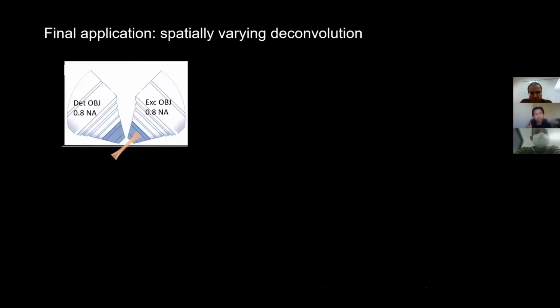So, it's always bothered me that in all of these microscopes we use, they're hopelessly inefficient, right? I mean, in the case of this Dualview light sheet microscope, we work at moderate NA. And so we collect less than half the fluorescence right off the bat, not to mention all of the optical losses in the imaging system. So it would be nice in some applications to collect more light at once.